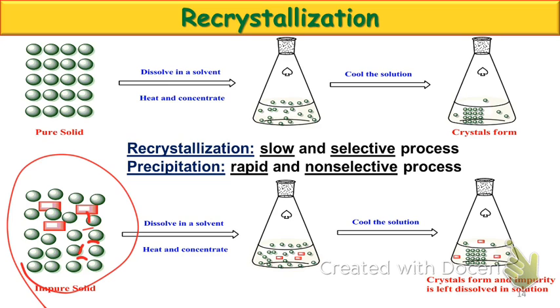We have to be able to get our impurities out of the solid. How are the impurities held in the solid? Intermolecular forces. So we break those forces apart, and then what we're going to do is cool it. Why would cooling cause crystals to form out of a solution?